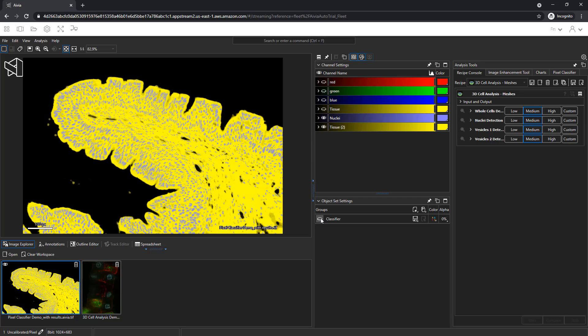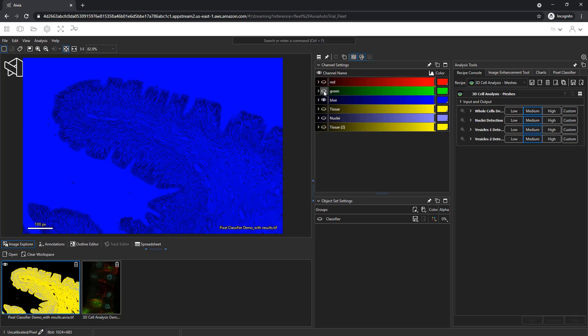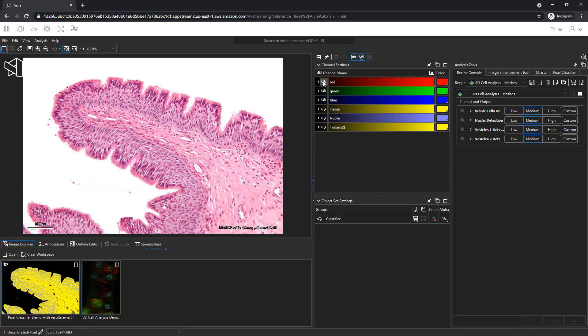The result image is split into two classes as given by the name of the channel. The tissue is in yellow and the nuclei in lavender. Turn off the tissue and nuclei channels and turn on the blue, green, and red channels.